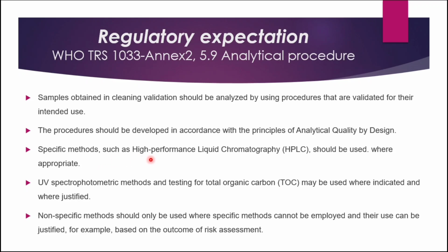Specific methods such as HPLC should be used. So the guideline is also recommending the use of HPLC wherever appropriate. UV spectrophotometric methods and testing of total organic carbon, that is TOC, may be used where indicated and where justified. If your UV spectrophotometric method is comparable with HPLC, or the TOC method is comparable with the HPLC method, in that case if justified you can very well use UV spectrophotometric method.